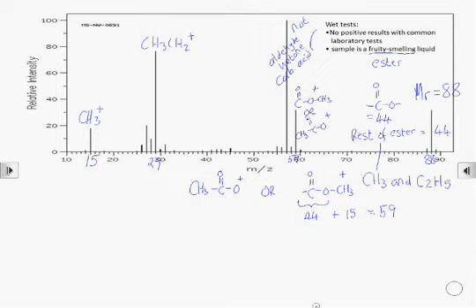We've got this very large peak at 57, which we haven't yet been able to decide what that is. So we need to come up with some other possible fragments of the molecule and match up where they would show in the spectrum. We could see whether the oxygen and the CH3 group are connected together. There we go, so an OCH3 fragment, that would show up at 31. And we do have a small peak at 31, so OCH3+ may well be a possible fragment ion.